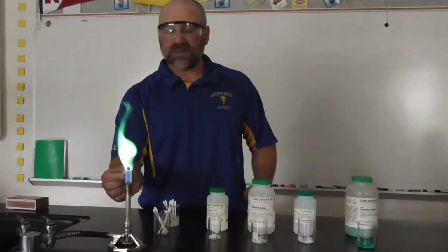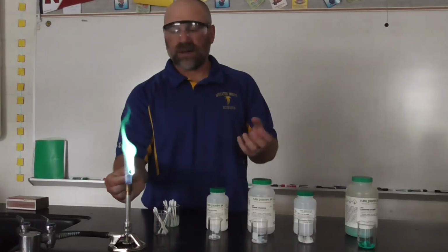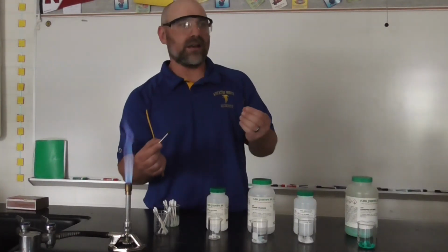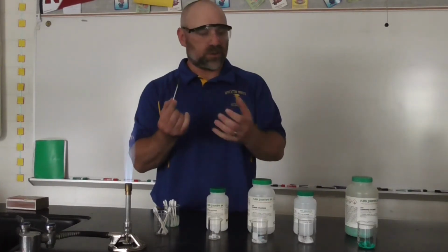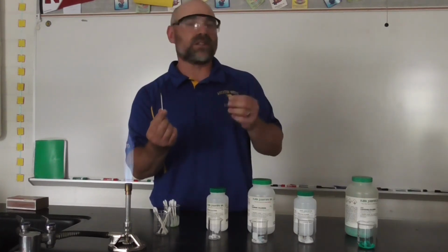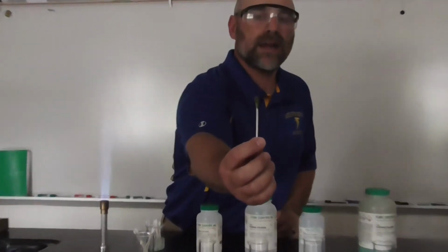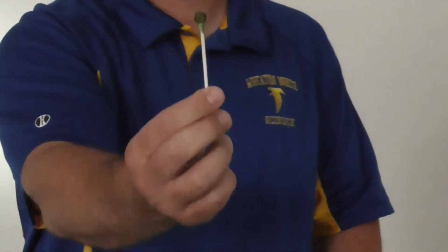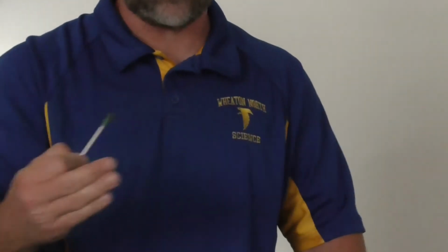Interestingly, one application of all of these is use in fireworks. When you see a firework, they have little pellets in there that contain various examples of these different salts, and the explosion from the firework acts as an energy source that energizes these salts, and those are the colors you'll see. Next time you look at fireworks, you might notice that the blue is slightly less bright than the other colors. If you look at this, you can see that the copper chloride has actually turned black. It decomposes at a lower temperature than these other salts, and therefore can't withstand as much energy before decomposing, so those blue lights aren't as bright as the other colors.